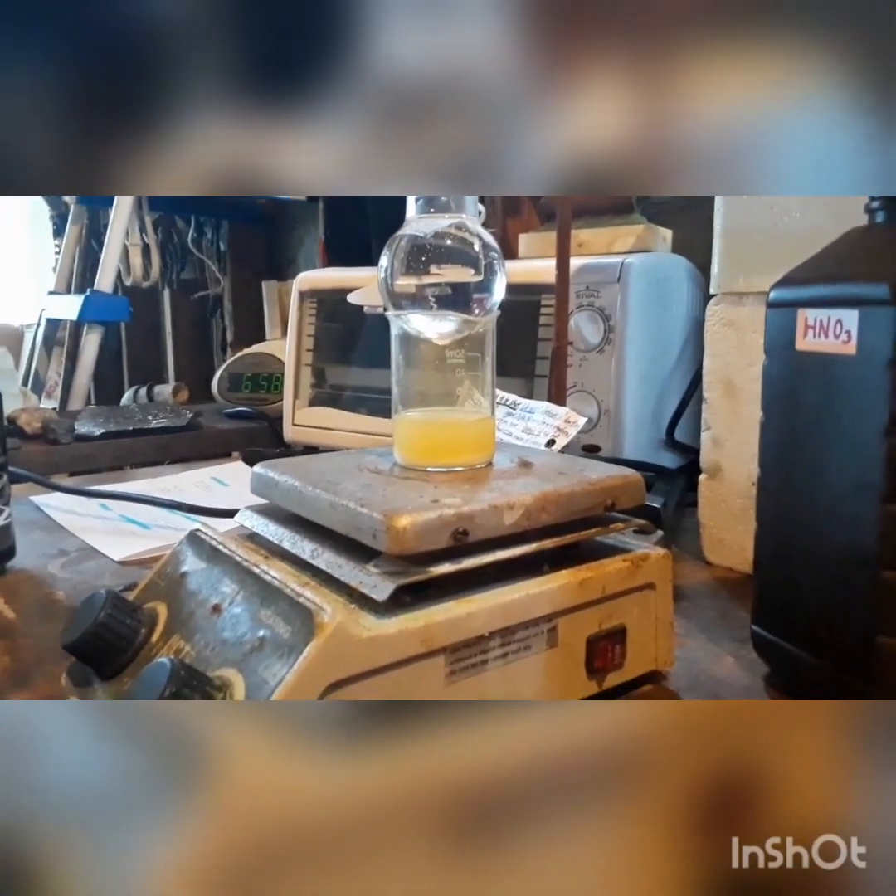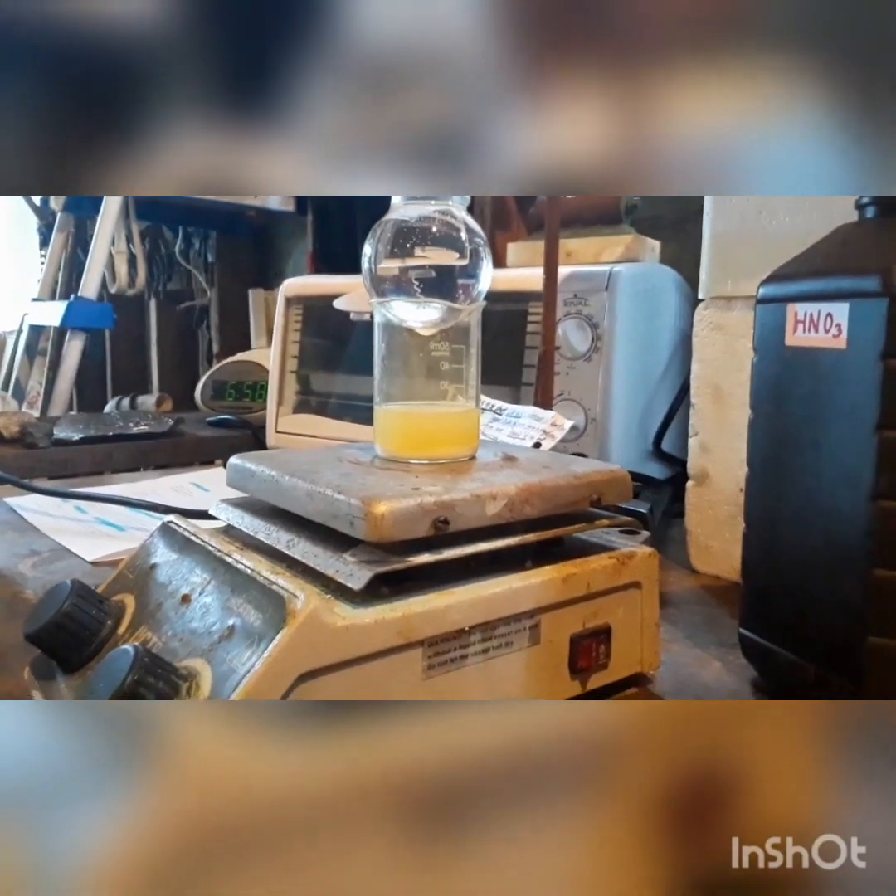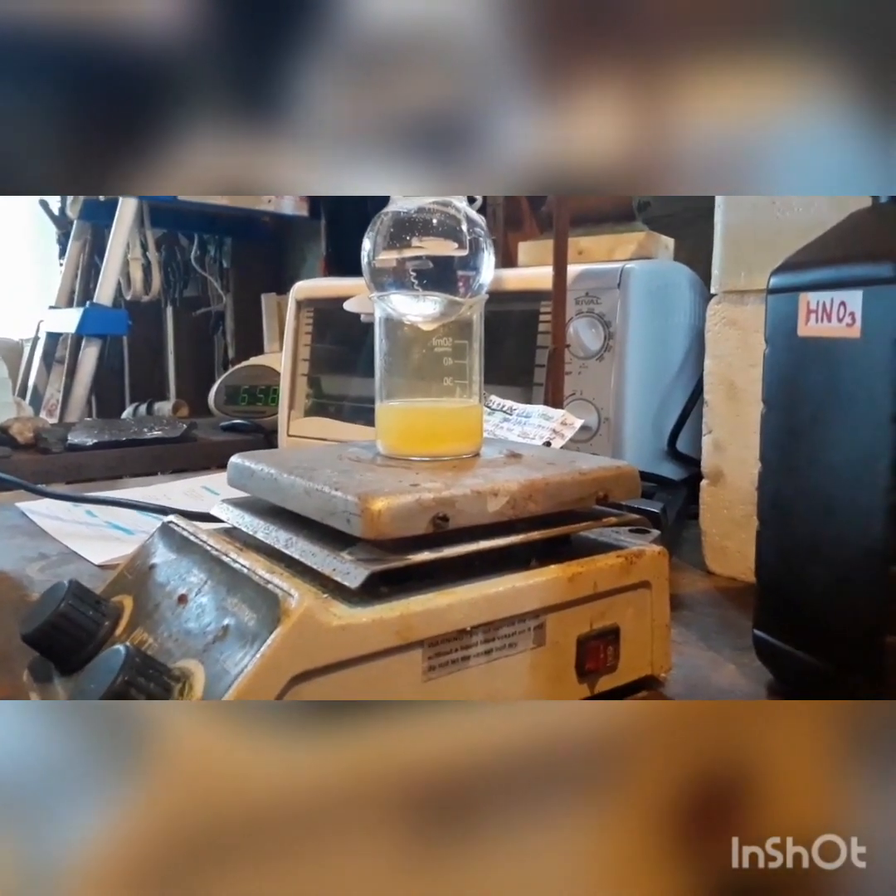Nitric acid is very precious since we pretty much have to just make it ourselves. Because if we were to buy it, it would run about $600 a gallon US — so it is pretty much even more expensive than gold.